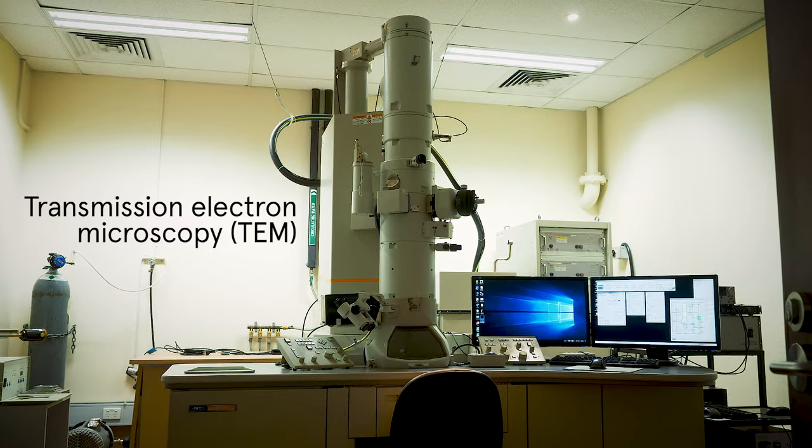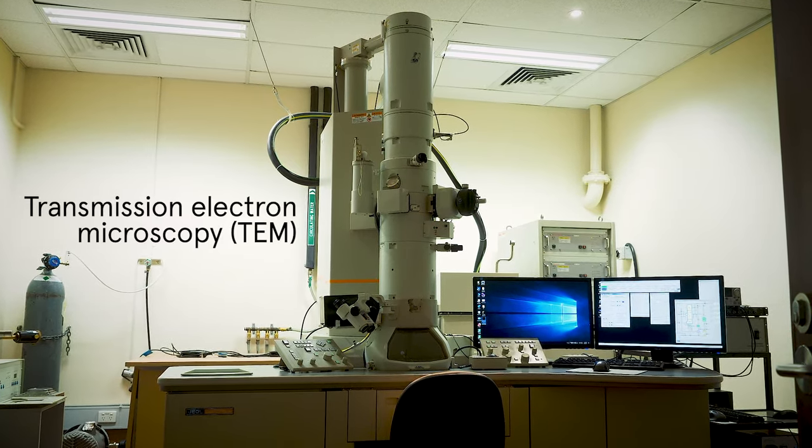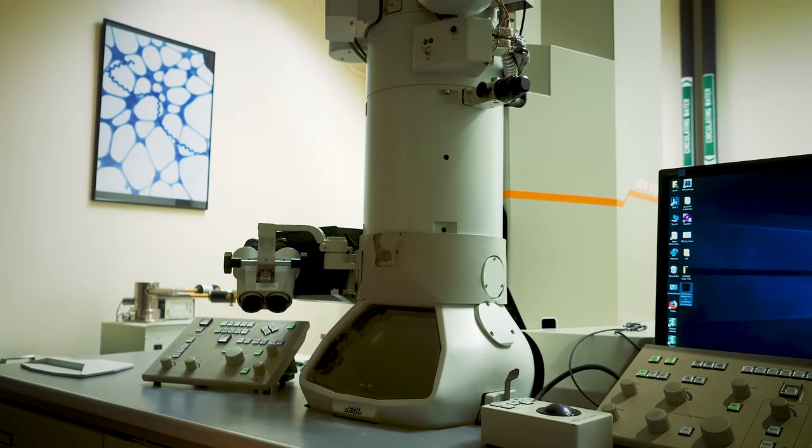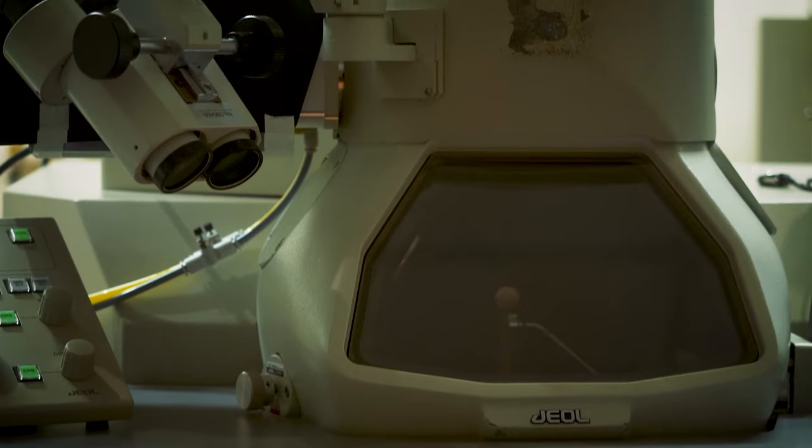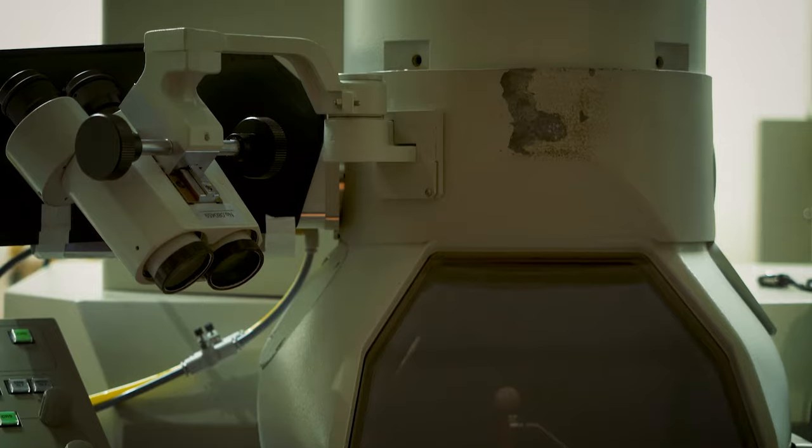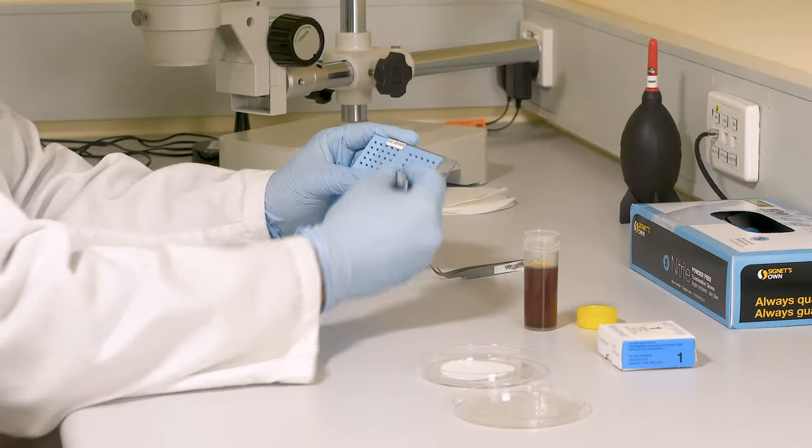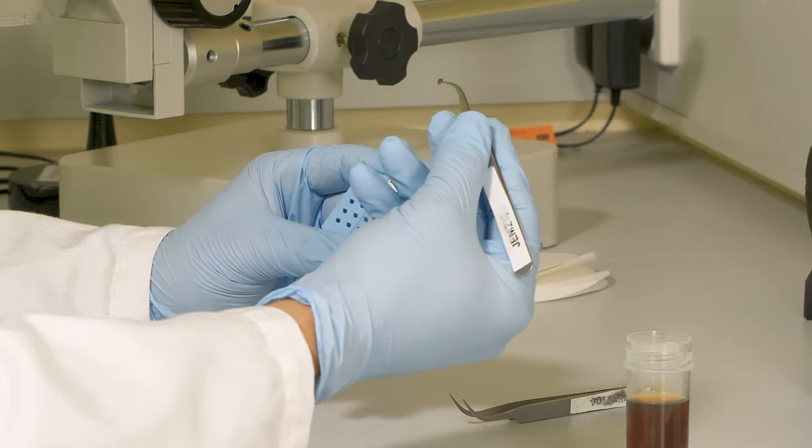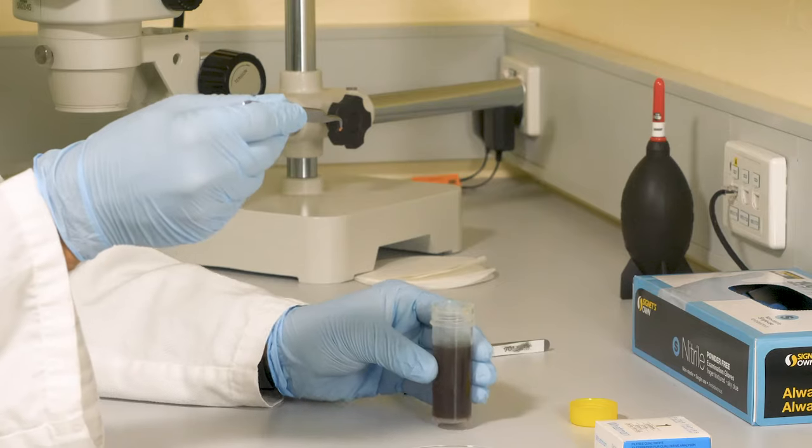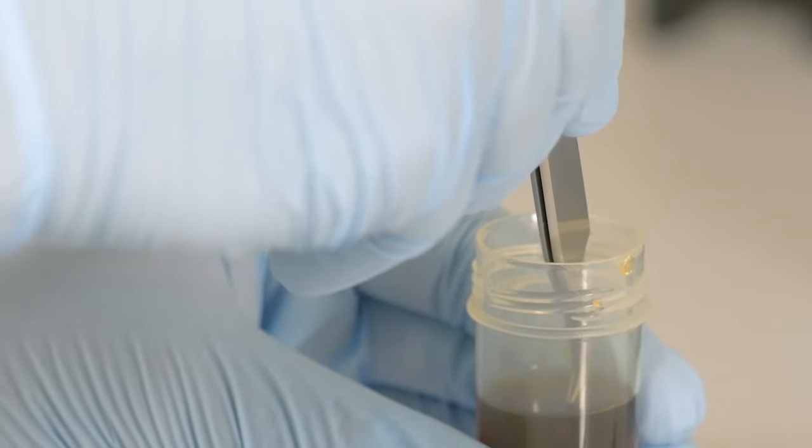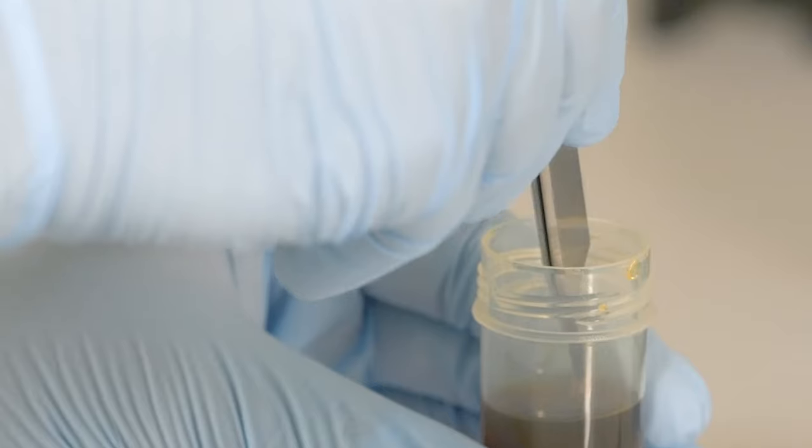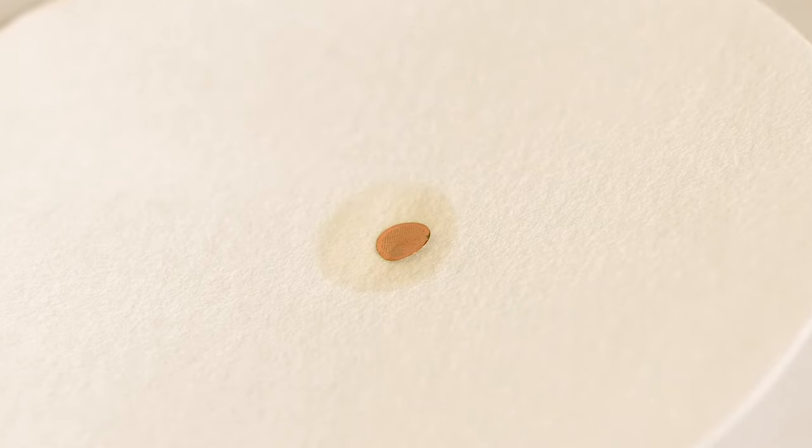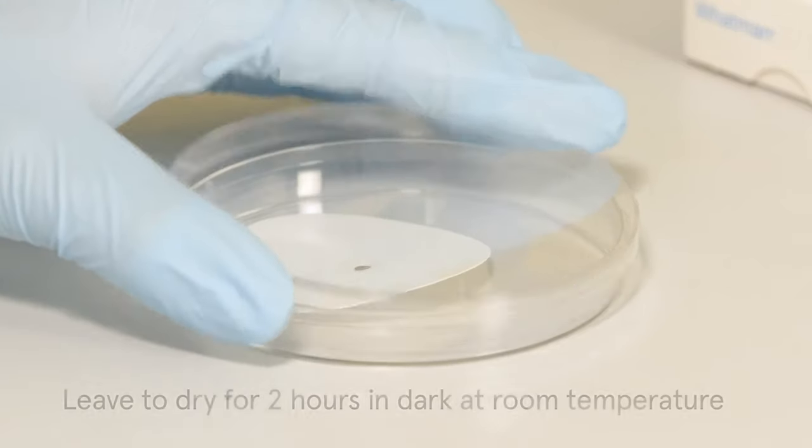I am going to use transmission electron microscopy or TEM as a super powerful instrument to measure the particle size of my carbon quantum dots. TEM is a microscopy technique in which a beam of electrons is transmitted through a specimen to form an image. First, we prepare the TEM grids by dipping the grid into the synthesized carbon quantum dot solution. We will leave it to dry for a couple of hours in the dark at room temperature.